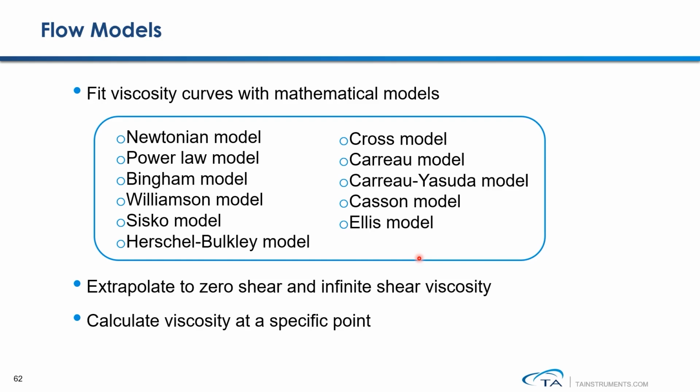The benefit of fitting your experimental data with one of these mathematical models is that it allows you to extrapolate and calculate the material's zero shear viscosity or infinite shear viscosity. The other benefit is that it allows you to mathematically calculate the viscosity of your sample at a specific shear rate condition, which may not be one of the data points in your test procedure.